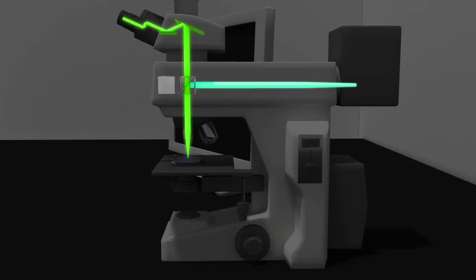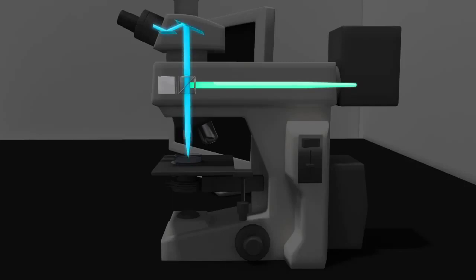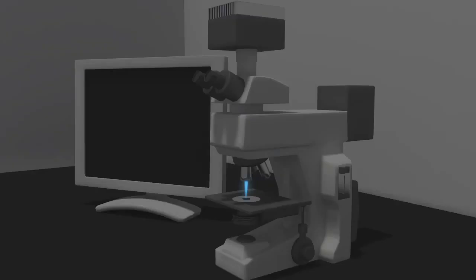One advantage to fluorescence microscopy is that it can be used to detect and visualize multiple fluorescent molecules by simply adjusting the excitation and emission filters to detect the relevant fluorophores in a sample.